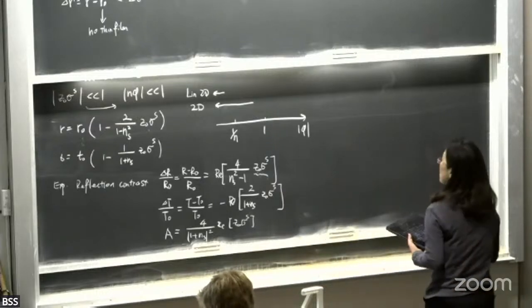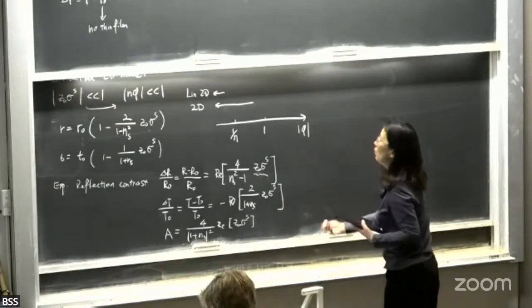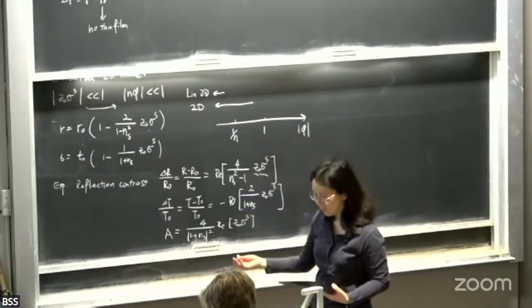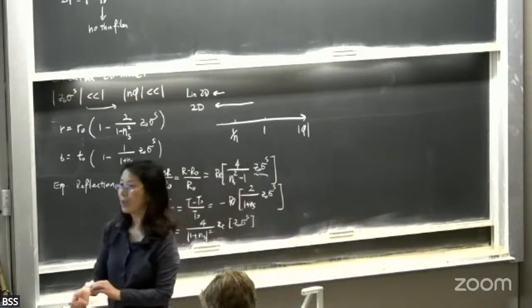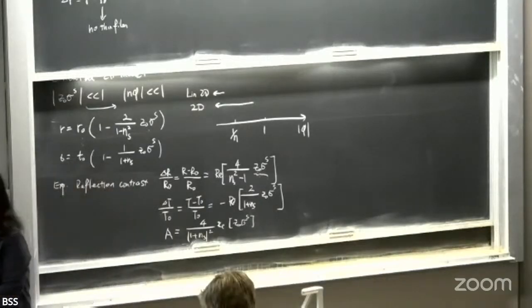So the question is, how do we determine this complex Z0 and sigma sheet conductivity for the measurements? And you may just say, okay, I'm interested in this complex quantity. I have a real part and imaginary part. I need to do 2 measurements. Once I have 2, I should be able to solve to get real part and imaginary part, right?